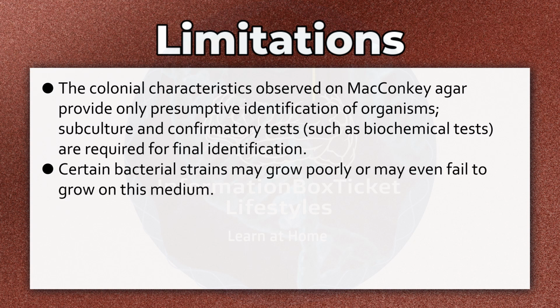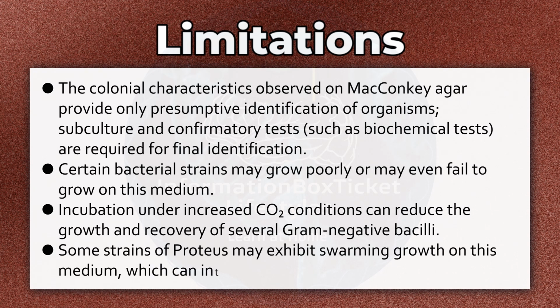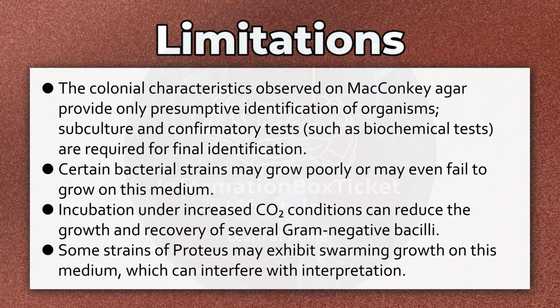Certain bacterial strains may grow poorly, or may even fail to grow on this medium. Incubation under increased CO2 conditions can reduce the growth and recovery of several gram-negative bacilli. Some strains of Proteus may exhibit swarming growth on this medium, which can interfere with interpretation.